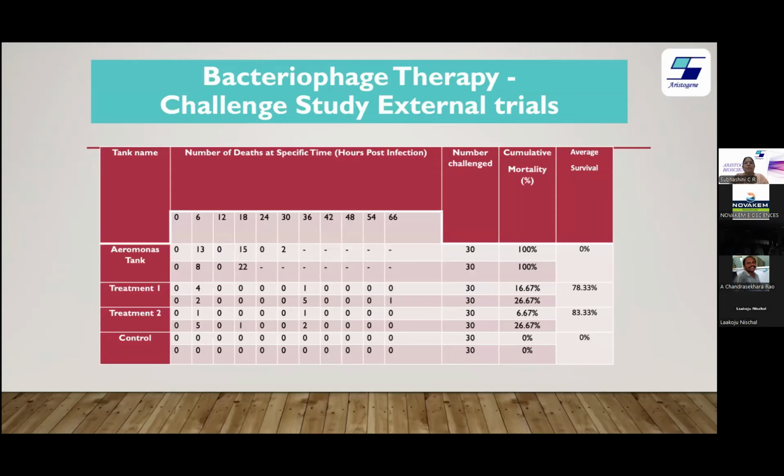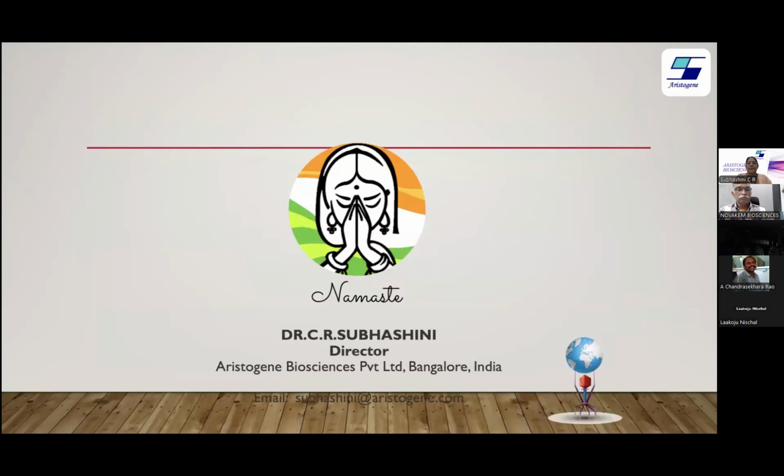This is in short about how we identify Aeromonas and other organisms from the diseased animal, and how we develop a strategy. Today, we are using antibiotics to curtail the infection, but we can use a natural and plausible alternative to antibiotics, which is bacteriophages, to control infection. We have done n number of studies, and this is being used in the field also to control Aeromonas and Pseudomonas infection. With this, if there is any question, I can take up.